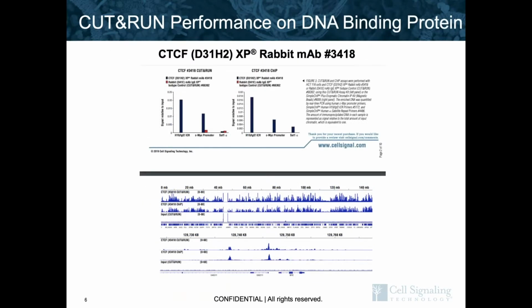The second sample is a DNA binding protein, CTCF. The function of CTCF isn't like a typical transcription factor, but it directly binds to DNA just like all of the transcription factors do. Its binding with DNA is weaker than histones, but stronger than cofactors. Again, just like the ChIP assay, the CUT&RUN assay can generate decent and reliable signals in both qPCR and NGS results.